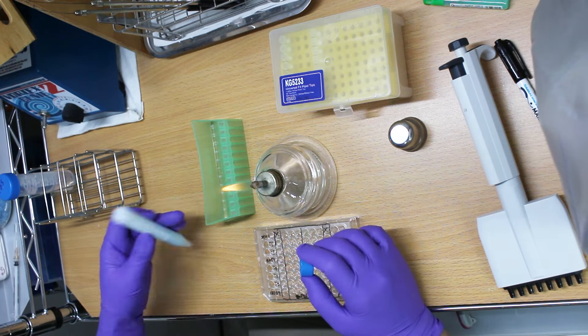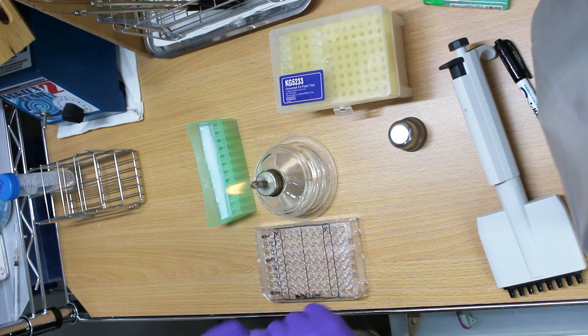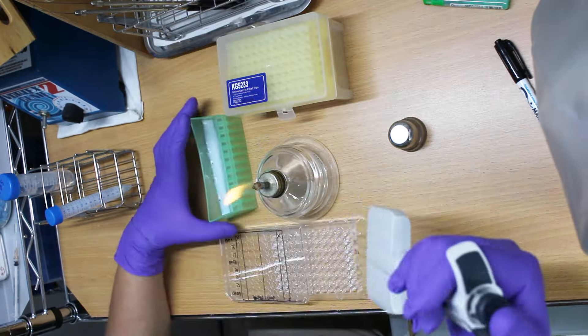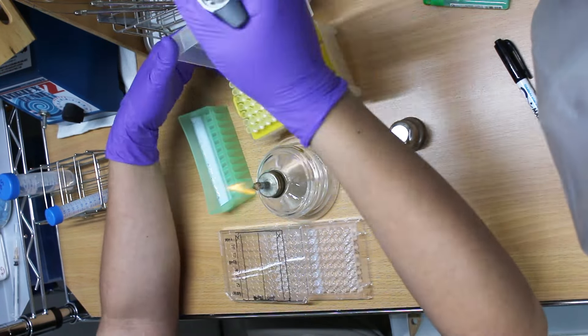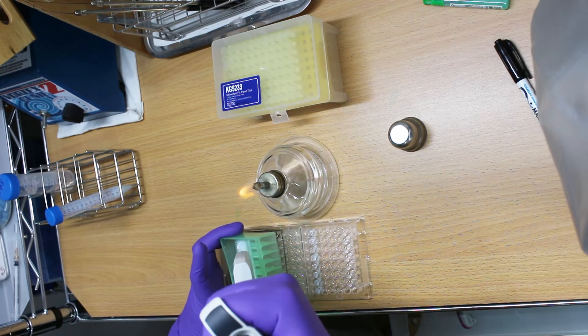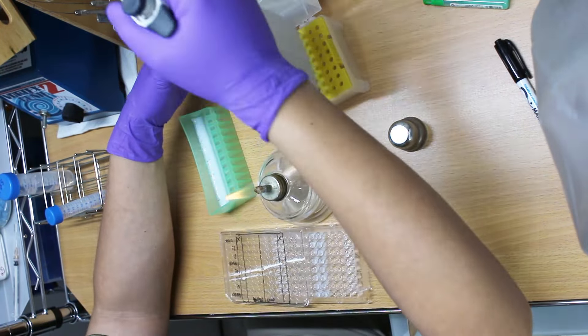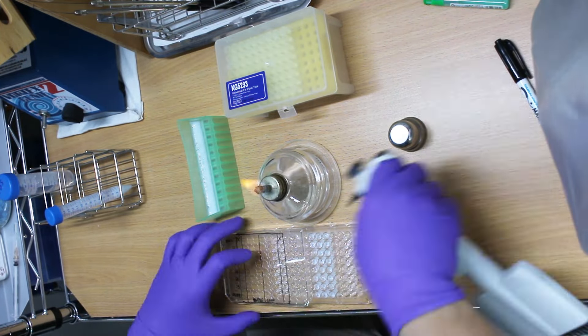So I prepared eight bacteria. Three are from my collection and five of them are isolated directly from my hand. And I'm going to mix them with the soap I got in my house. I'm using a 15% concentration of soap plus normal saline.